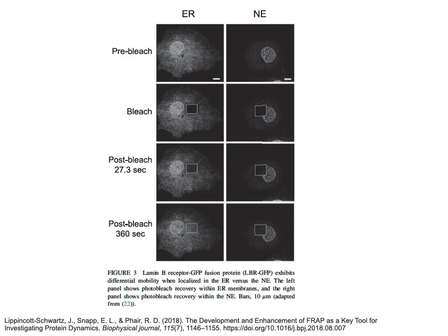A general-use, non-confocal fluorescent microscope doesn't have the range to pinpoint. That's why a confocal microscope is traditionally used, because with a confocal microscope you have more control of where the laser is focused. So that allows you to bleach a specific area.